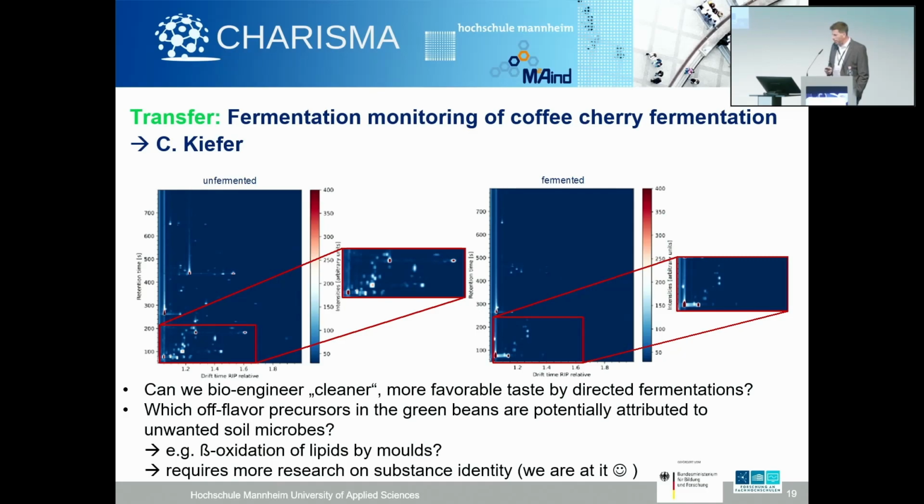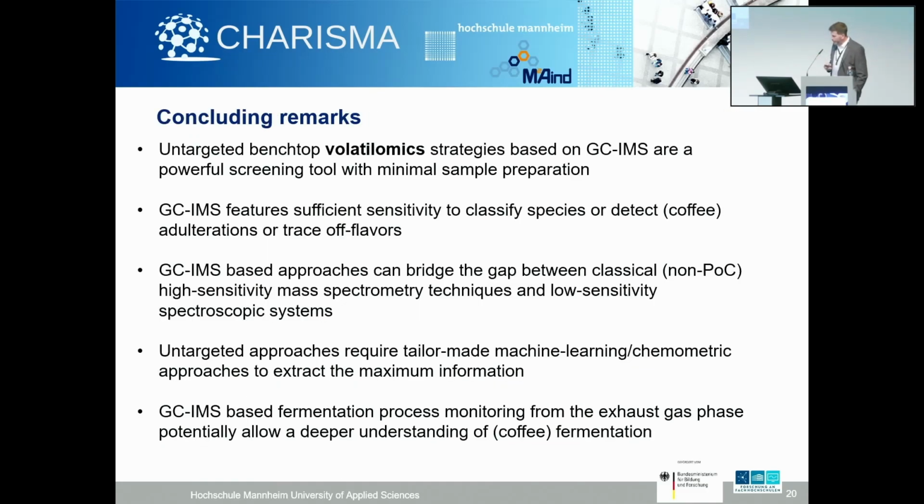Most probably we're going to have an Orbitrap in mid-November, attached to that system as well, so a confirmation of the substances will be much easier. So with that, hopefully I didn't take too much time.